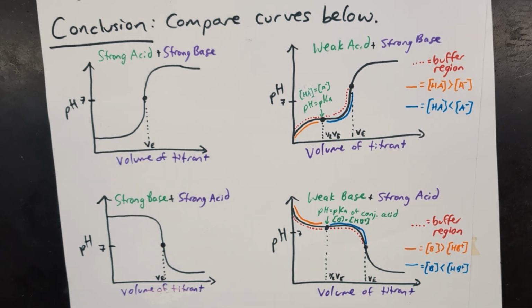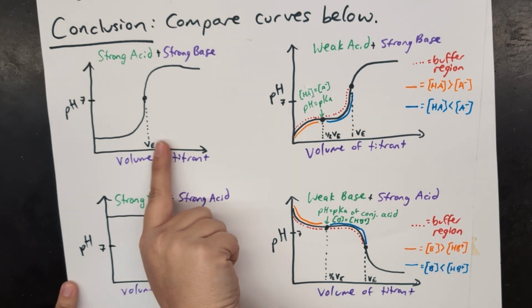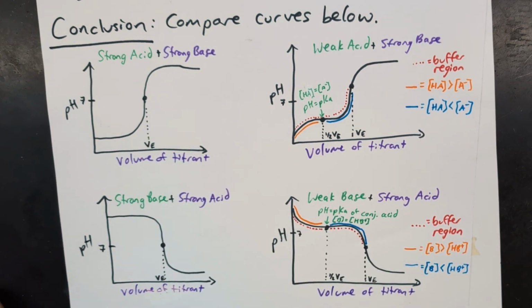In terms of errors for this, sometimes they'll talk about there's extra water left over in the burette. That's a really common one. So that means that with the extra water in the burette, there's lower concentration than expected of your titrant. So your volume to reach equivalence point will be higher than it should have been because it's diluted, so you need more of it to fully neutralize the analyte.